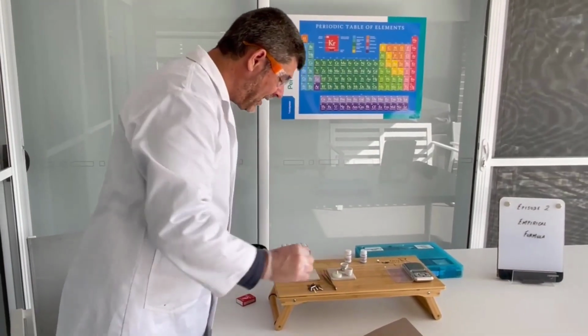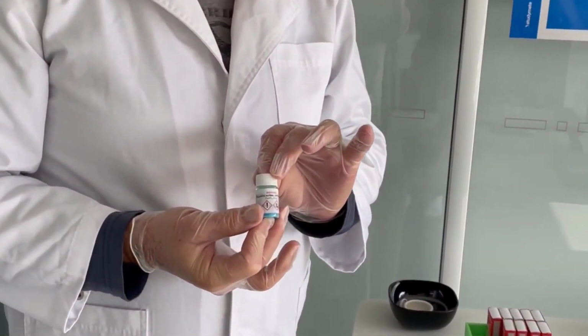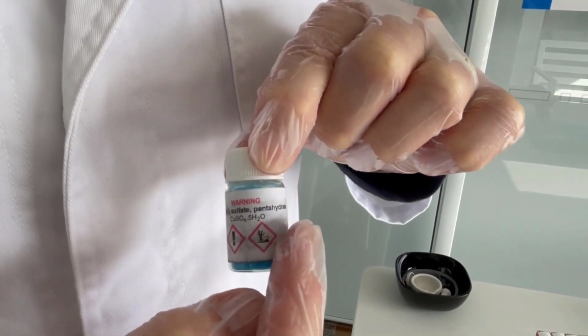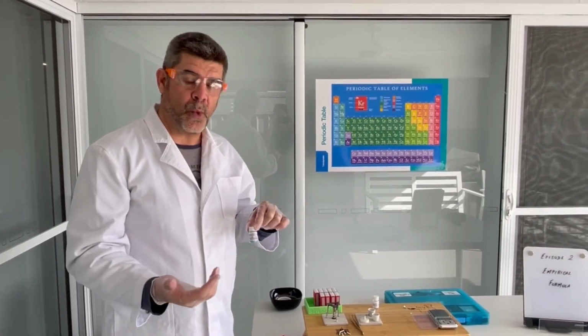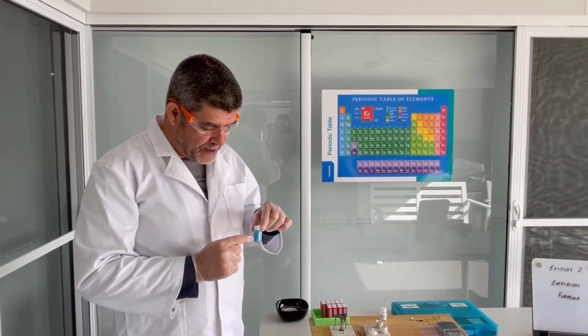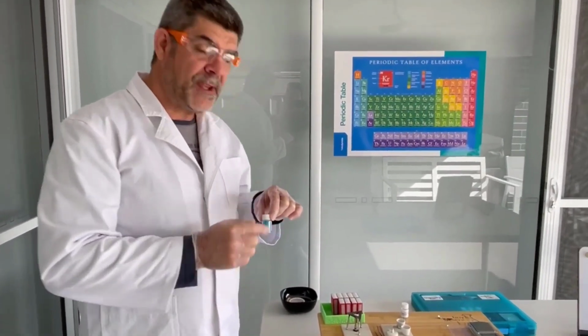The second way of calculating empirical formula is to again use one of the substances we used in our first episode. So this is copper sulfate pentahydrate. Penta means 5, and if you hydrate yourself, you take on water. So that means there's actual water molecules that are locked up in the crystal structure here. So what we want to do this time is the same thing we did before.